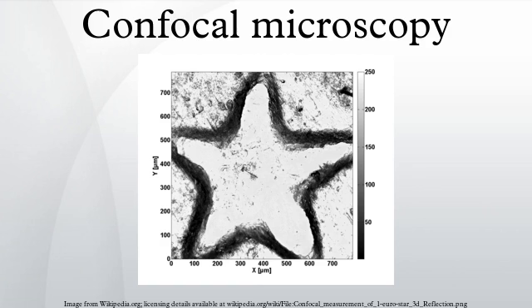Confocal microscopy is an optical imaging technique for increasing optical resolution and contrast of a micrograph by means of adding a spatial pinhole placed at the confocal plane of the lens to eliminate out-of-focus light. It enables the reconstruction of three-dimensional structures from the obtained images. This technique has gained popularity in the scientific and industrial communities, and typical applications are in life sciences, semiconductor inspection and materials science. Basic concept.